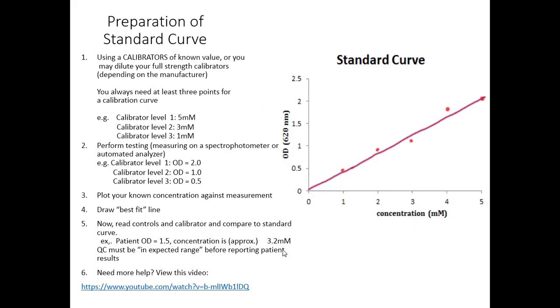Let's look at preparing a standard curve. I have down here a video that's going to go a little bit slower for you. It's not a perfect video. It's not bad. And I'm hoping you've done it before. If you haven't, we can talk about this on either Thursday or the following Thursday when we meet. I'm happy to do an example of a standard curve with you on the board. Someone just needs to remind me.